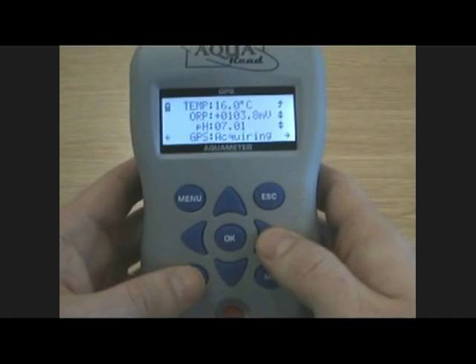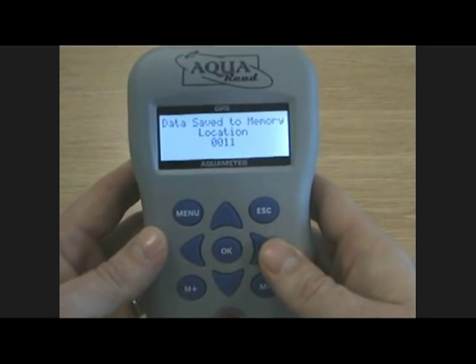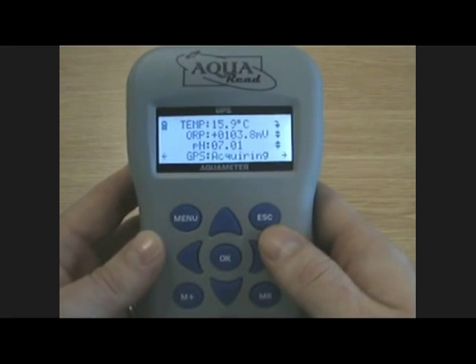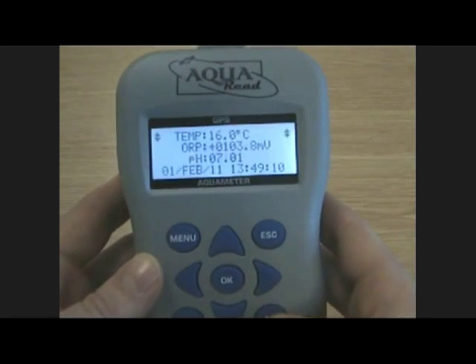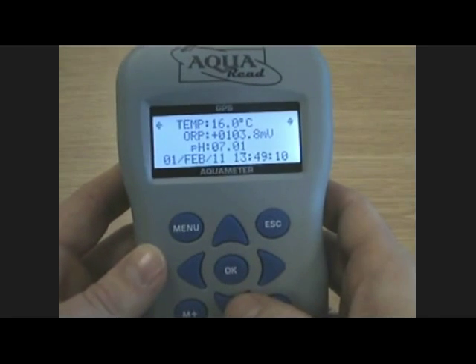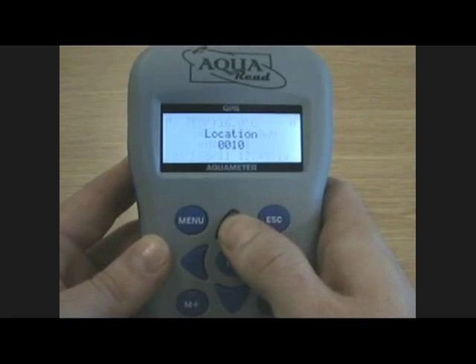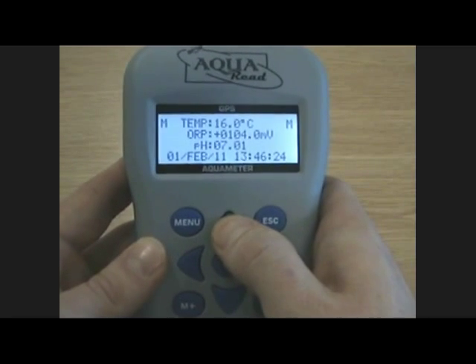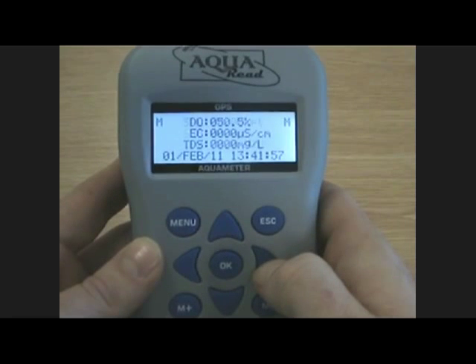One simple button press is all that's required to capture all of this information. By pressing M plus, the data is saved to the memory. By pressing memory recall, we can view that data. The last data taken is the first to be displayed and previous data sets can be displayed by scrolling upwards. Left and right will show you all of the data that's been captured.